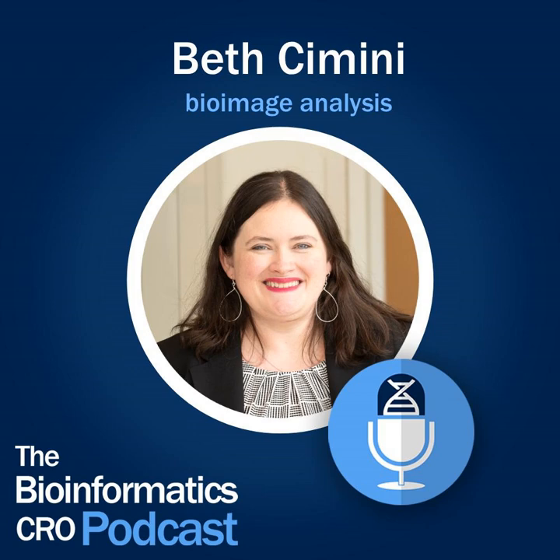What makes cell painting useful for learning about cell state? Yeah. So I can explain cell painting a little bit first for folks who've never come across it before. Cell painting is an assay developed here at the Broad in the early 2010s, where the idea was, and it was a more controversial idea at the time than it certainly is now, we have these cell images. They're beautiful. They're full of particular stains and particular markers to learn particular biology.